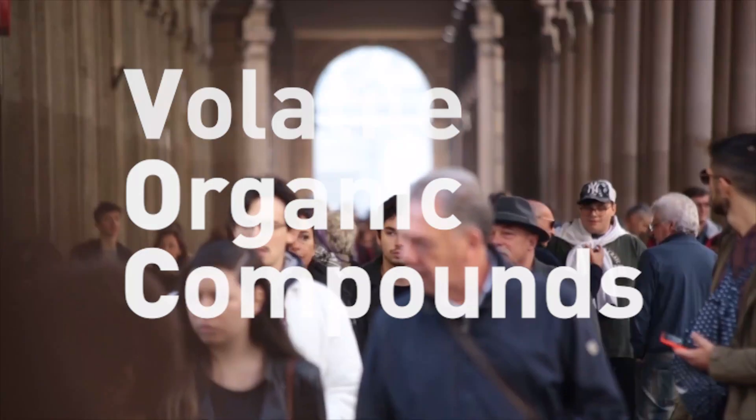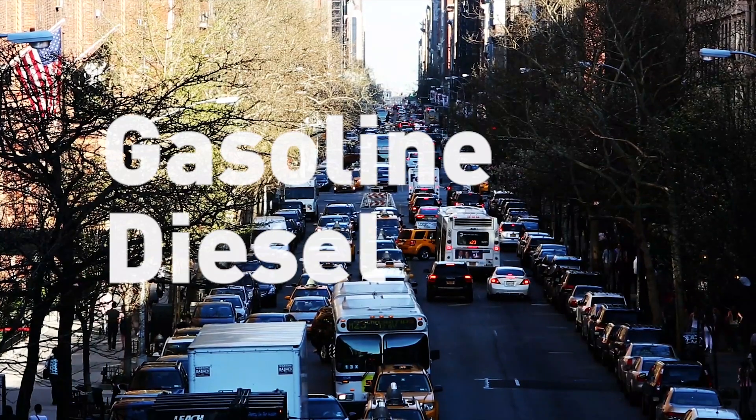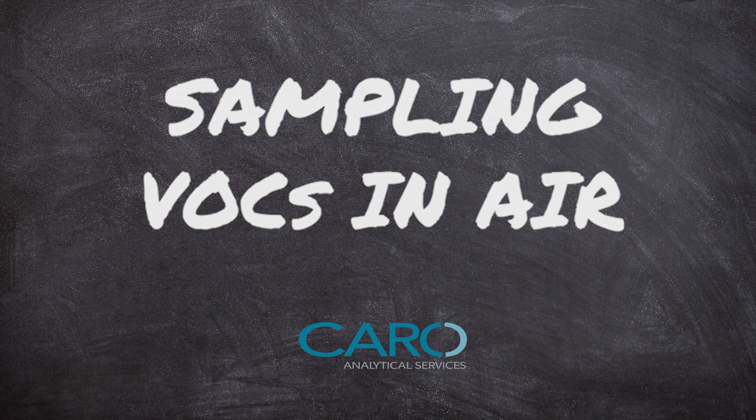VOCs are volatile organic compounds. They're present in everyday stuff like gasoline, diesel, and dry cleaning products. Today we're going to give you some sampling tips for soil vapor because we know it can be a bit tricky. Hopefully this can help you to get it right the first time.